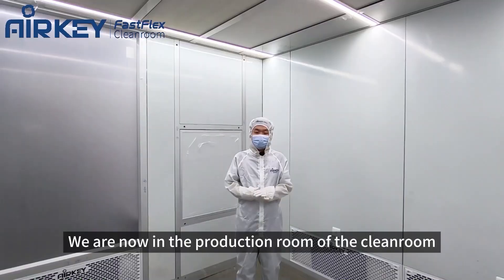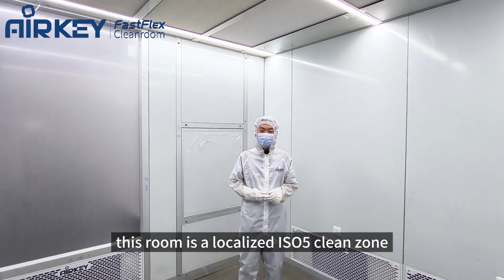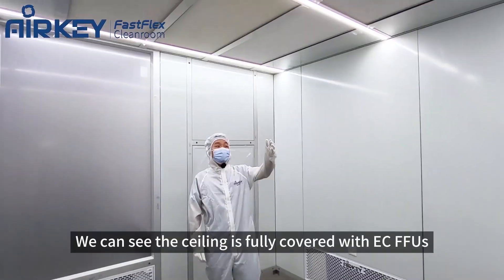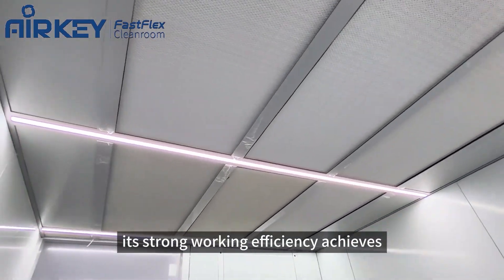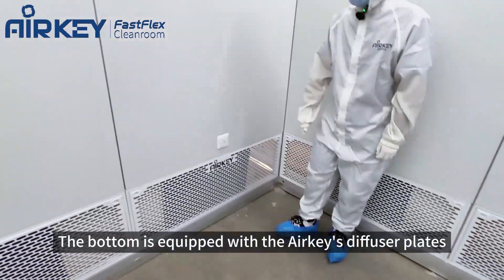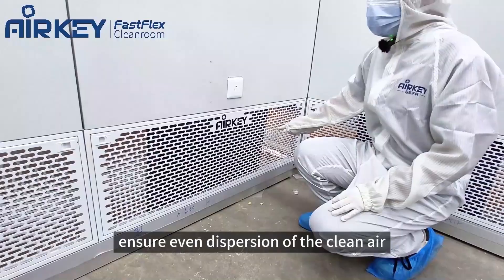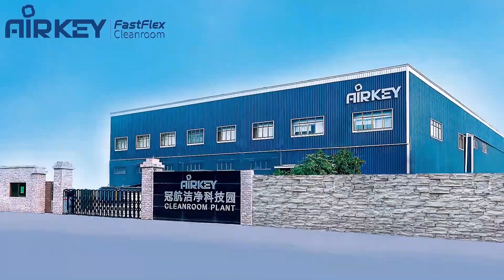We are now in the production room of the cleanroom. This room is a localized ISO 5 clean zone operating within an overall ISO 7 environment. We can see the ceiling is fully covered with FFUs. Their strong working efficiency achieves a superior clean level. The bottom is equipped with air return diffuser plates.